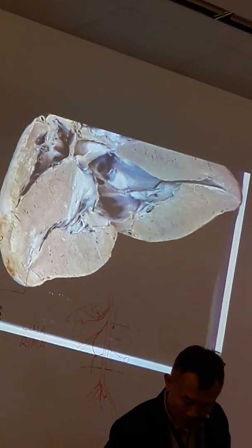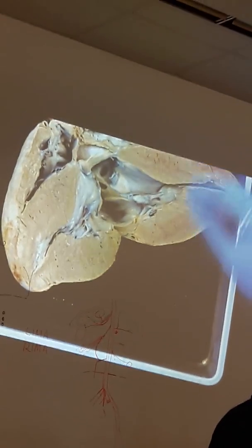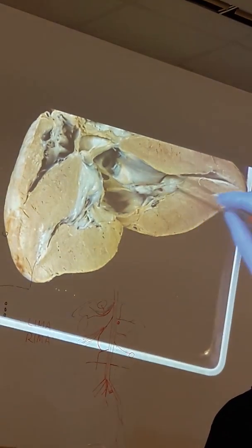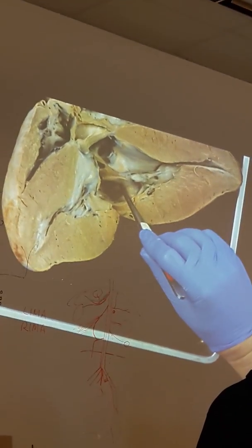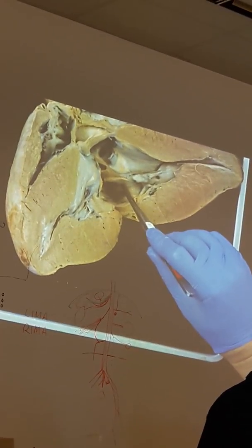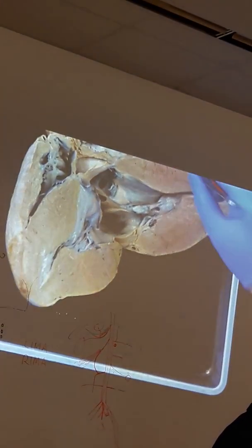So that's the trabeculae. Left atrium, you find left ventricle. Left atrium is above the left ventricle. This is left ventricle. So above the cuspid. Okay, if I point you here, say the space. That's left atrium. Right. Right ventricle, the thinner side.